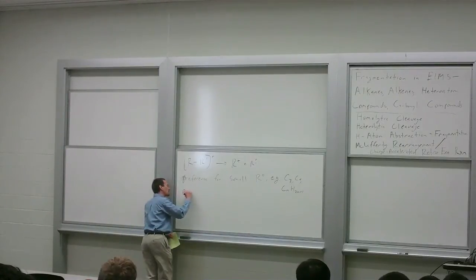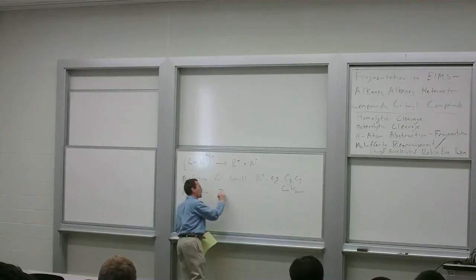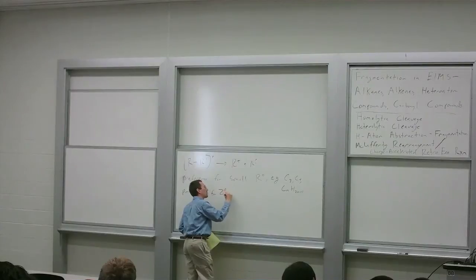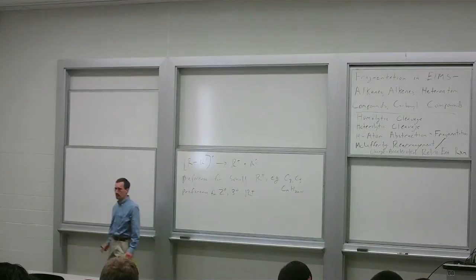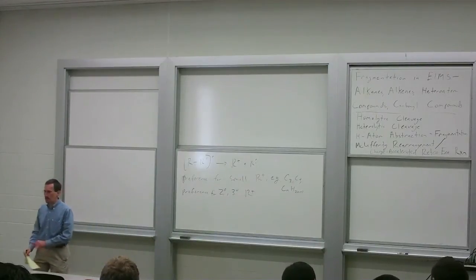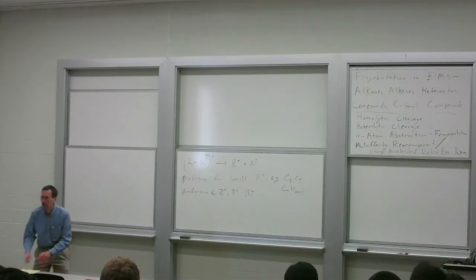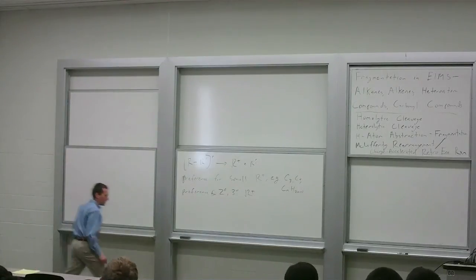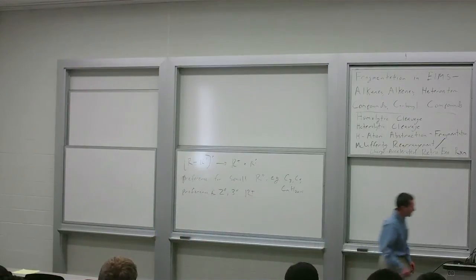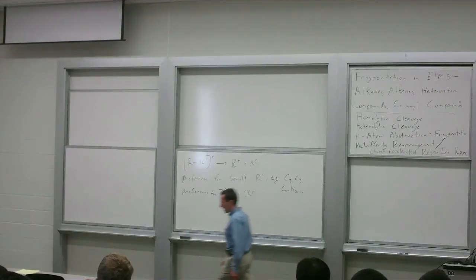There is a preference for secondary and tertiary. Just like in solution phase chemistry, but that preference isn't absolutely carved in stone because, again, your molecules are very hot in the gas phase. They have a lot of energy to overcome barriers. So I want to put up the spectrum here. And it's the first one in the handout. Spectrum of dodecane.